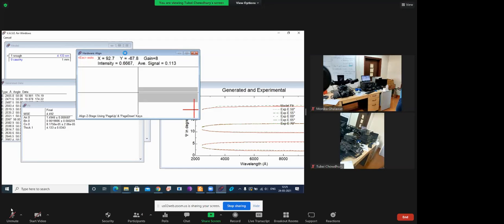Now, why is there a sudden shift from 180 to 0? Because one of the components, the p polarized component, would be less. In the equation we can see that the Fresnel coefficients Rp and Rs would be there. When one of these components changes drastically, coming to a zero value, psi and delta will change. So psi will go to zero, and delta will go to 90 degrees. Okay, thank you.